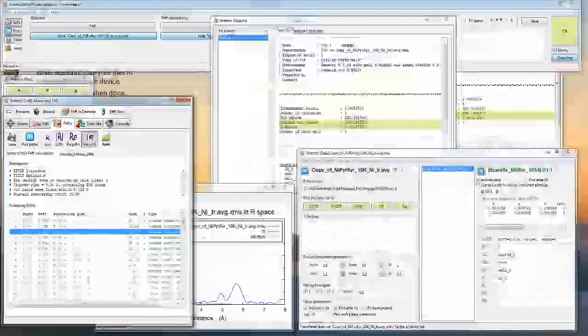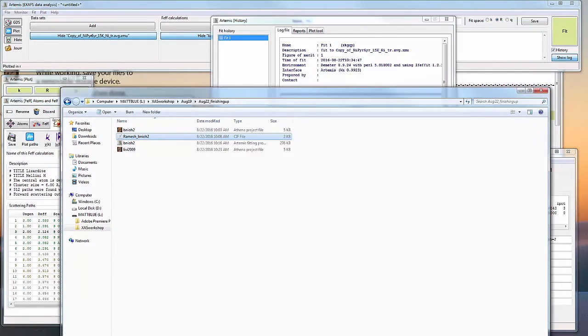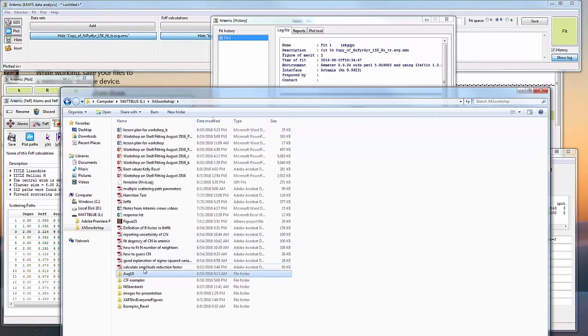And so how do you fix that? Atoms doesn't do its cluster calculation if there's partial occupancy. So in order to fix that, you need to go into the CIF file itself and change it.